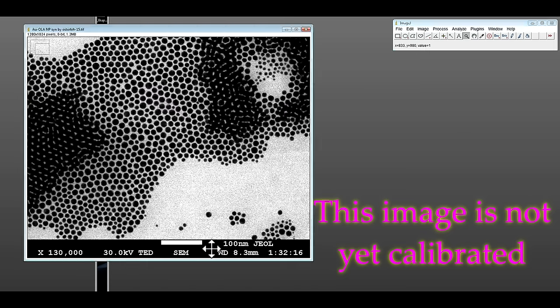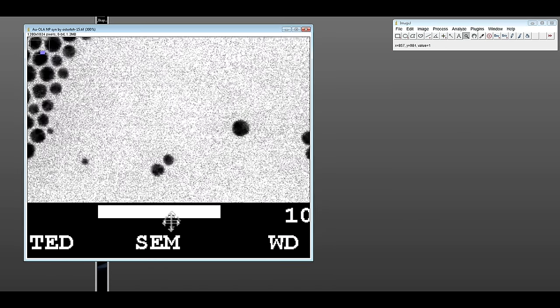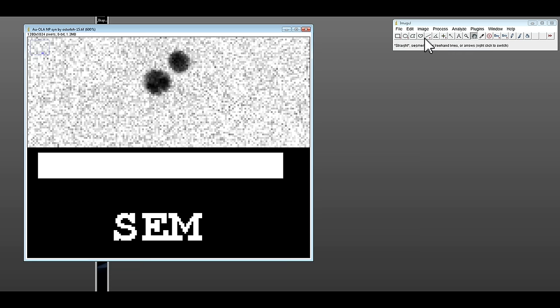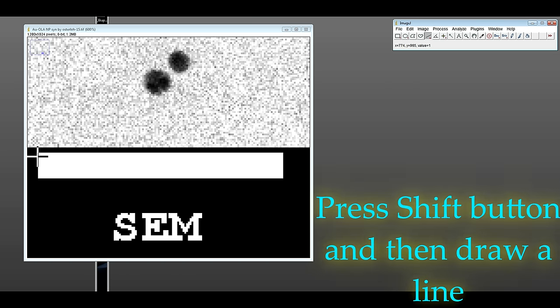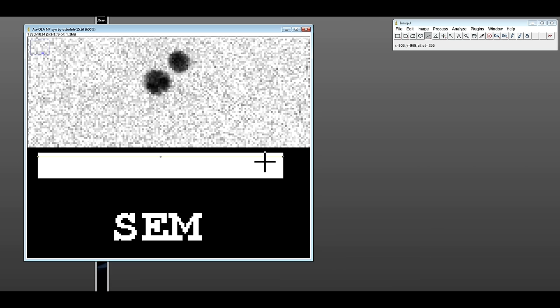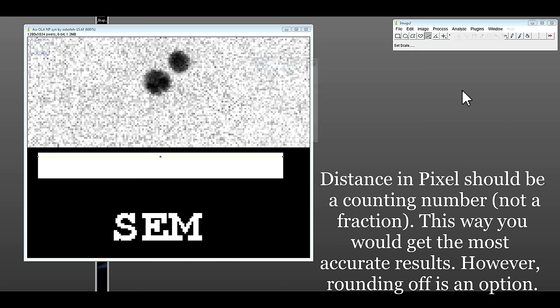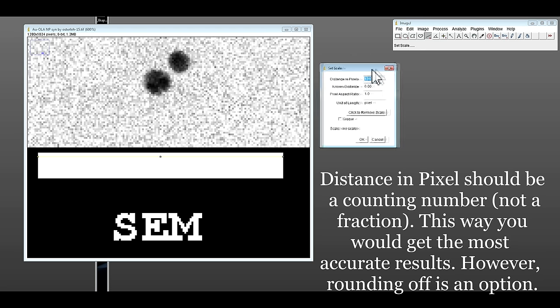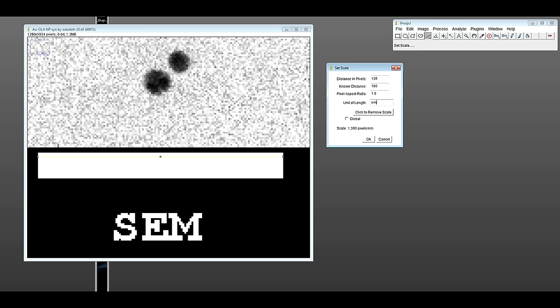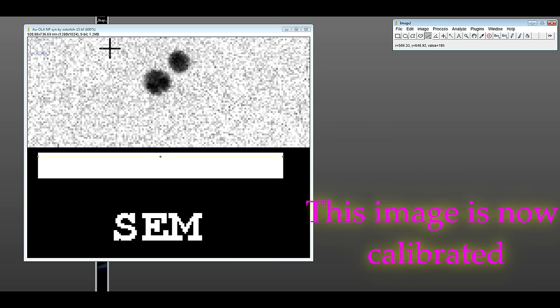Let's zoom into the scale bar. So this is 100 nanometer. Shift, that's about right. Analyze, set scale 139 and we know it's 100 nanometer. OK. So you can notice here the scale has been changed.